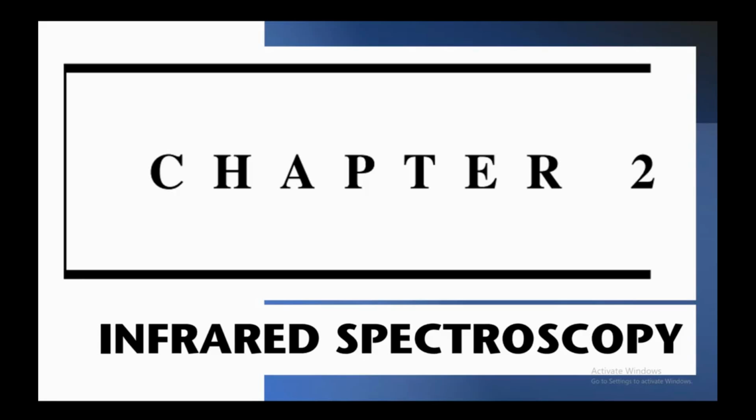Later on, in more videos that I'll upload about IR spectroscopy, we will discuss in depth the different functional groups of organic compounds that show IR spectra, and we will be dealing with the IR spectra of polymers, peptides, amino acids, different heterocyclic compounds, and many other things that will be discussed related to IR spectroscopy in this playlist.